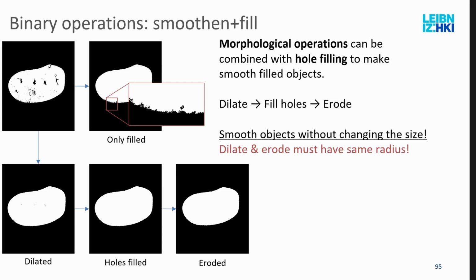It was a paper about a clearing method for light sheet fluorescence microscopy data, so doing the clearing of the sample that uses a clearing agent that is not toxic. And to showcase that it works properly, they had to, of course, measure the shrinkage of the tissue. This was done all in mouse kidneys.